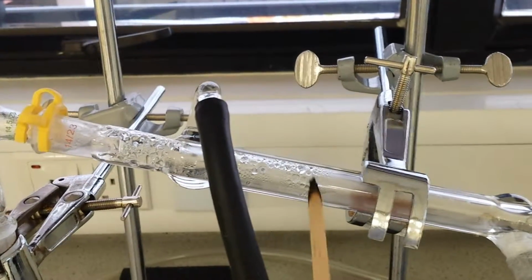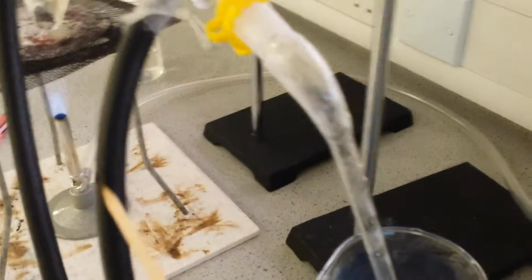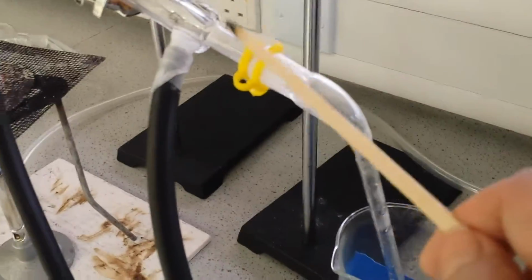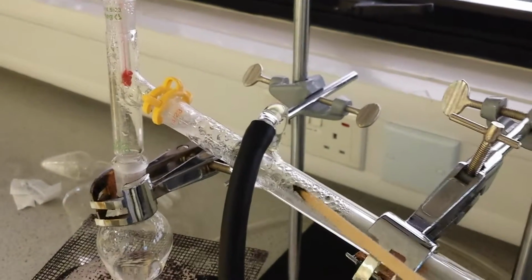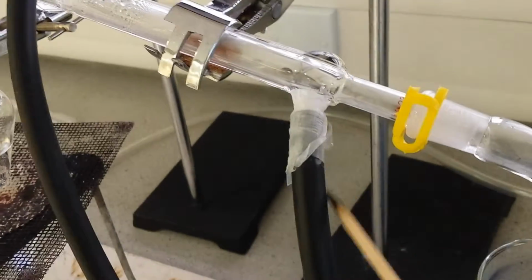Why is it a condensing tube? See, there are two tubes over here, two rubber hoses. This tube is connected to a tap of cold water. So what you have is cold water passing through the condensing tube. Why? So that the steam, which is very hot, when it passes the condensing tube, cools down and changes state from gas to liquid. Now you can see the water enters here and then it exits over here, into the sink.